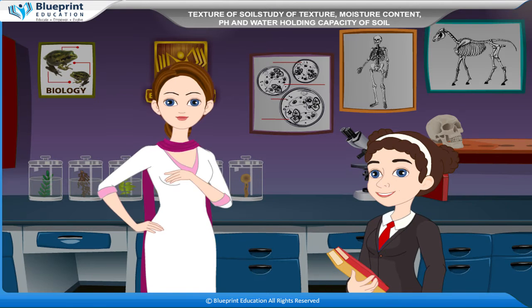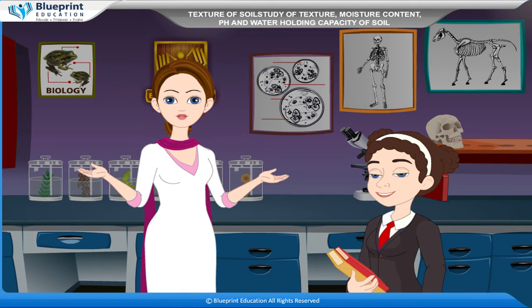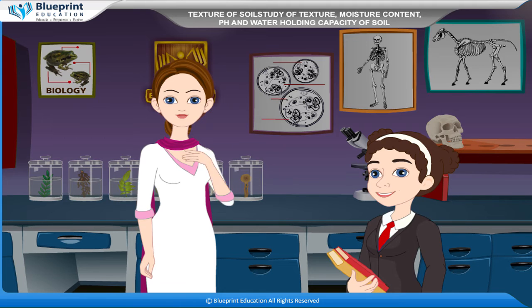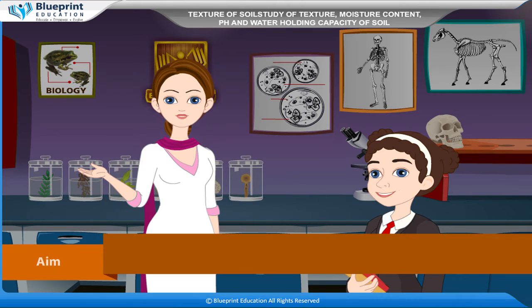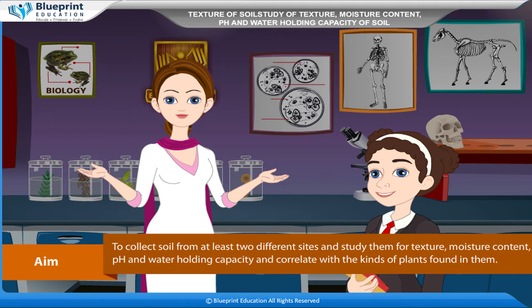Let's do an experiment to collect soil from at least 2 different sites and study them for texture, moisture content, pH, and water holding capacity, and correlate with the kinds of plants found in them. Our aim here is to collect soil from at least 2 different sites and study them for the same properties.